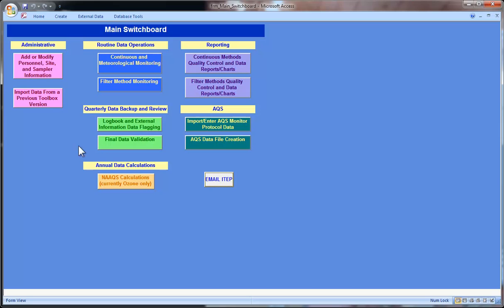Yes, we are done, and we are finished with this exercise, except for getting out of the toolbox, finding it in your folder, right-clicking it, making a copy, and pasting it into your backups folder, and then getting a copy of the toolbox to your instructor.